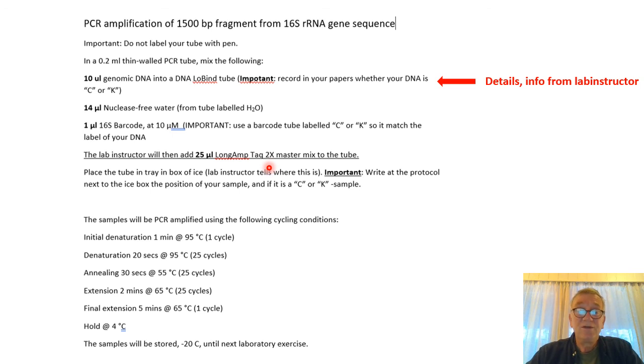In addition to the enzyme, you will have the PCR primers, as you remember, and also some nucleotides, because when we are building DNA in the PCR, of course, we need nucleotides to produce DNA molecules. So there's enzyme, there's primers, there is nucleotides, and there is a suitable buffer for this.